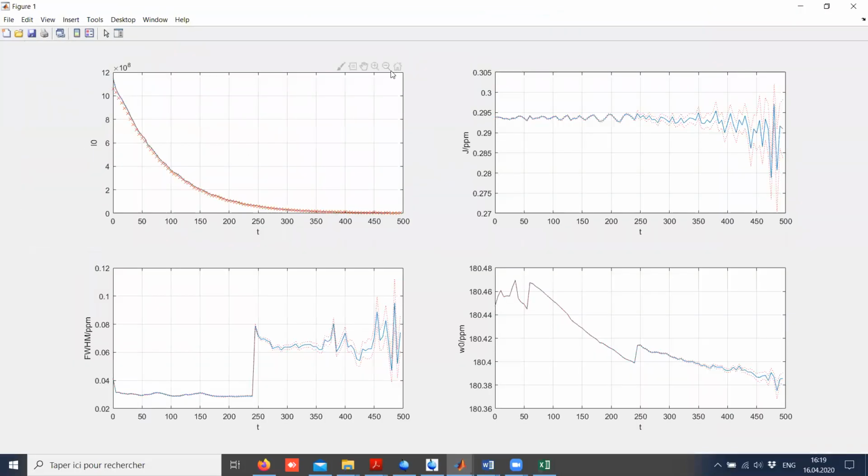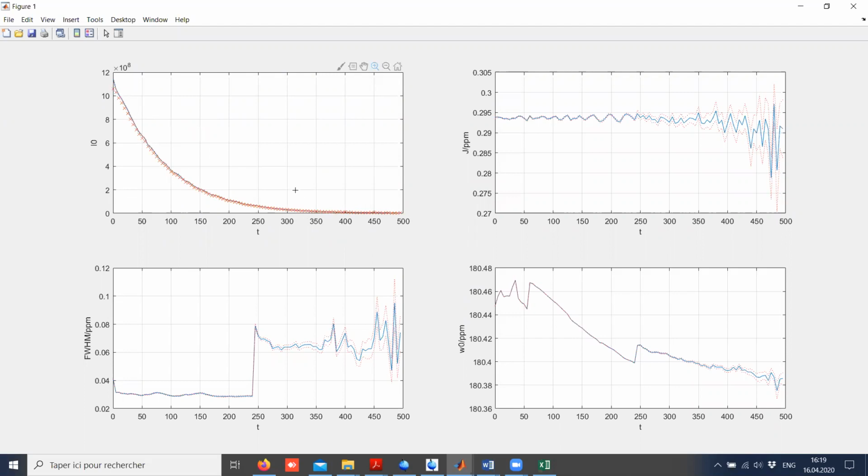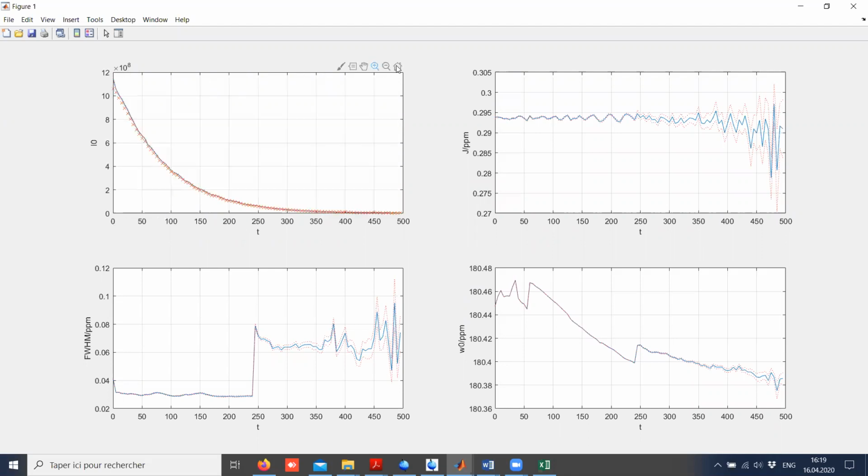And it does. So now you see, in blue, it's the fit, and in orange, it's the numerical integral, it's just the sum. You see that they overlay more or less well, but not perfectly. And what is interesting now is to repeat the mono-exponential fit, but not on the integral here, but on the fitted spectrum.